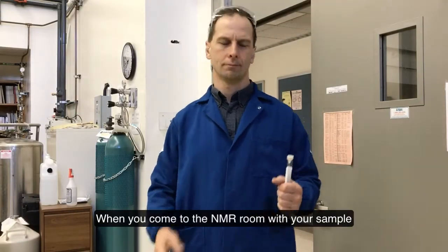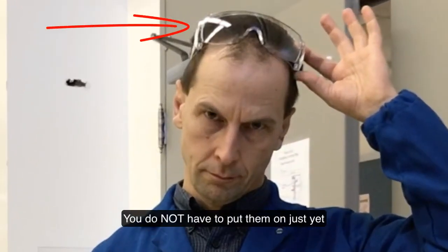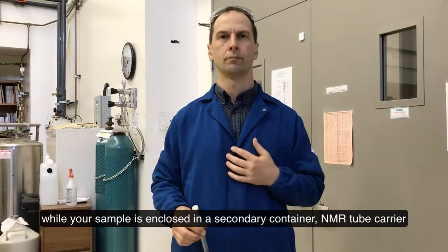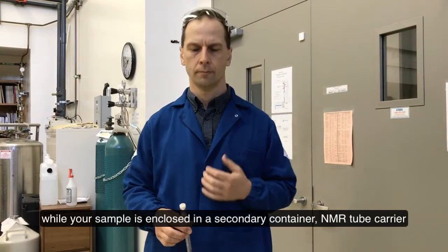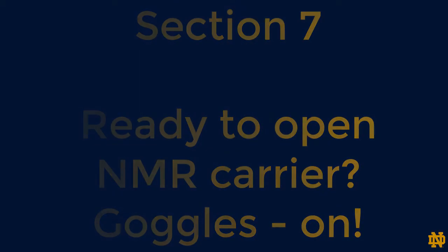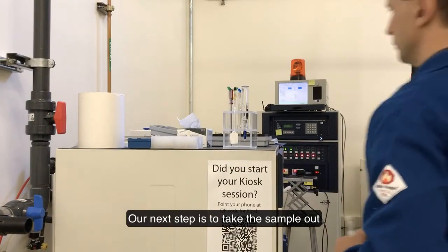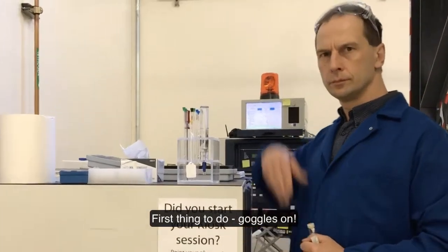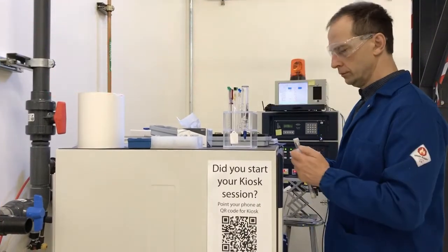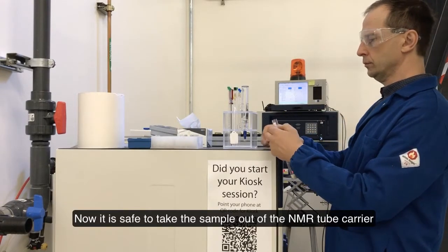When you come to the NMR room with your sample, it is important that you bring your goggles. You do not have to put them on just yet while your sample is enclosed in the secondary container — the NMR tube carrier. When you are ready to take the sample out, put your goggles on first. Now it is safe to take the sample out of the NMR tube carrier.